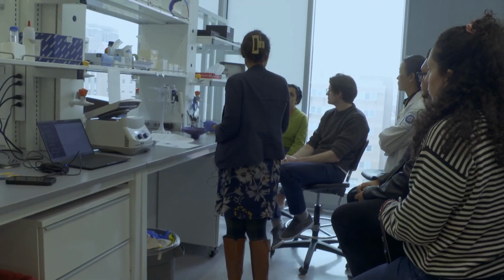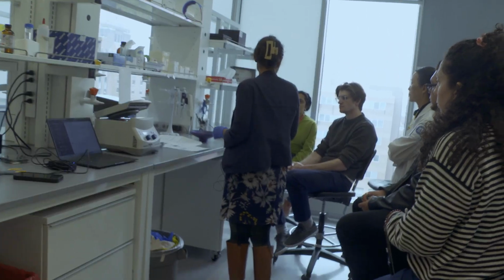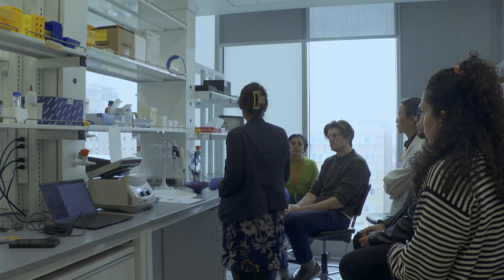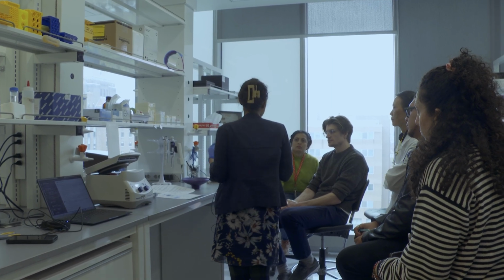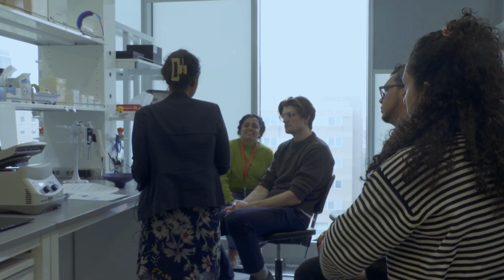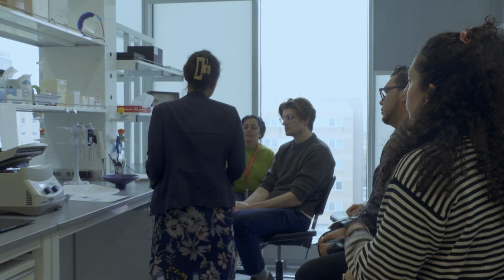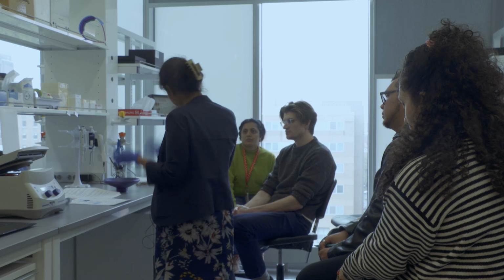Do you normalize the sample concentration based on the genomic peak that you find, or do you just load 6 nanograms in all of the samples? If there is genomic DNA, Oxford Nanopore's protocol says they don't have any suggestion, because the way those protocols are optimized, there should not be any gDNA.